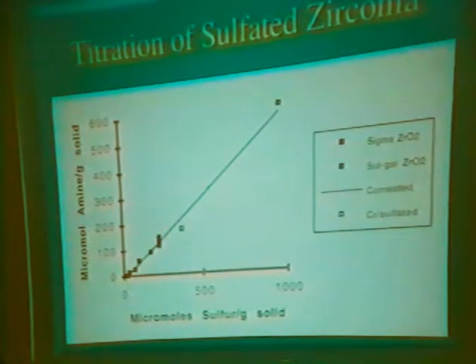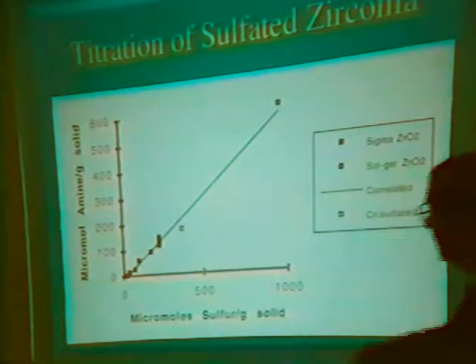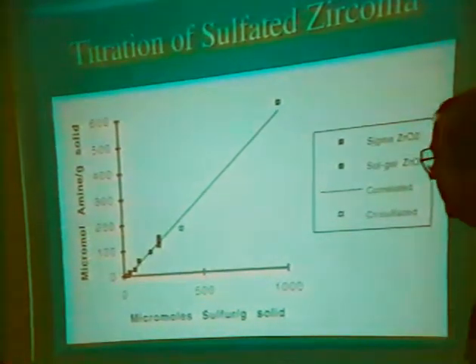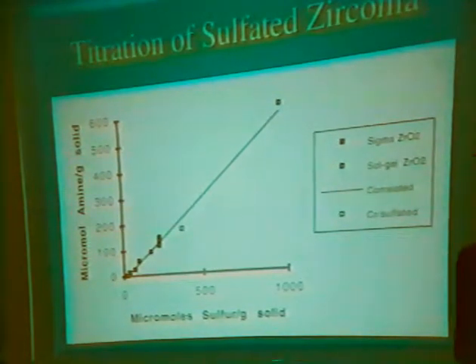But on the other hand, its proximity to the red line suggests to me that its Bronsted chemistry is perhaps not unlike the chemistry you'd expect from these samples, but it has more sulfur. And this perhaps confirms in our own minds some of the things we've read in the literature, that the Bronsted site density is in some way related to the sulfur loading.